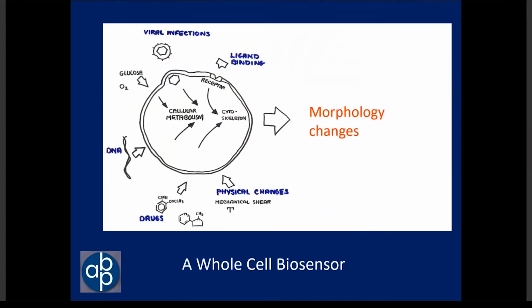When anything changes the morphology of the cells, those paths, in particular the ones under and between the cells, can be altered by a morphological change. The same is true if the membrane becomes more convoluted and there's more surface area, the current finds an easier path by coupling through the membranes.